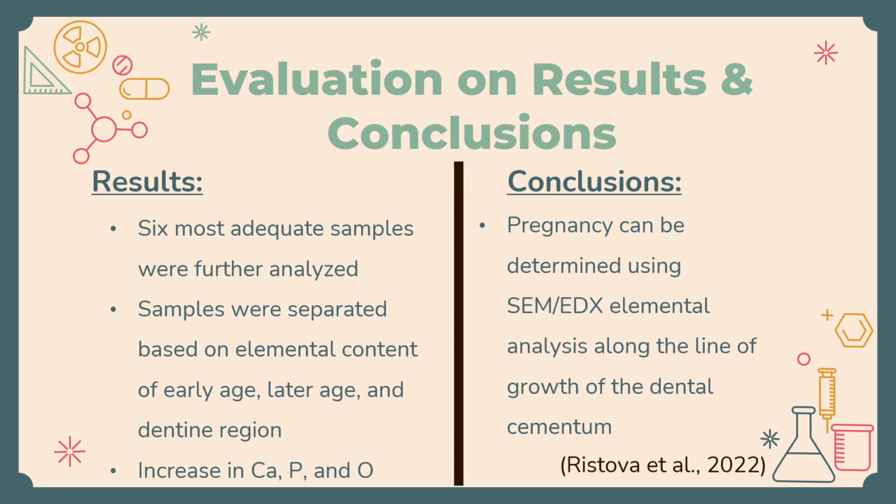The authors noticed an increase in calcium, phosphorus, and oxygen. And as for the overall conclusion, it was found that pregnancy that resulted in a childbirth was able to be determined using this SEM EDX elemental analysis along the line of growth on the dental cementum.